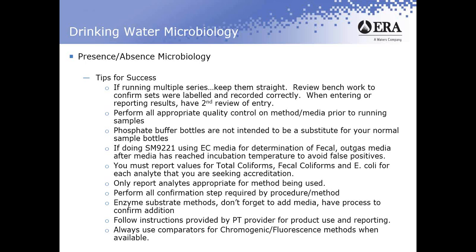Phosphate buffer bottles are not intended to be a substitute for your normal sample bottles. So the phosphate buffer dilution blanks that are provided are not intended to be used as a sample test vessel. They're designed to reconstitute your lyophilized sample, and then you should use whatever your normal method container would be.